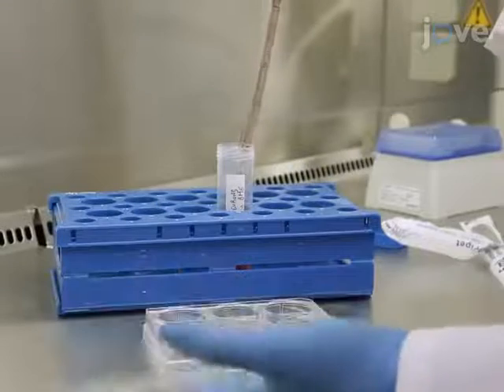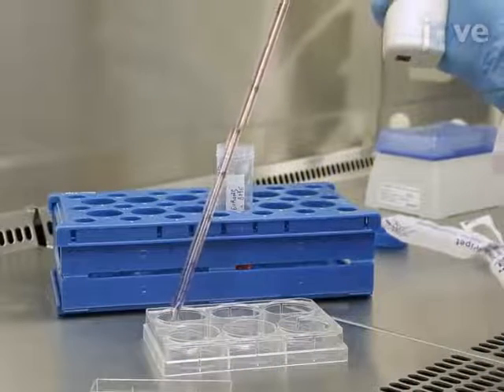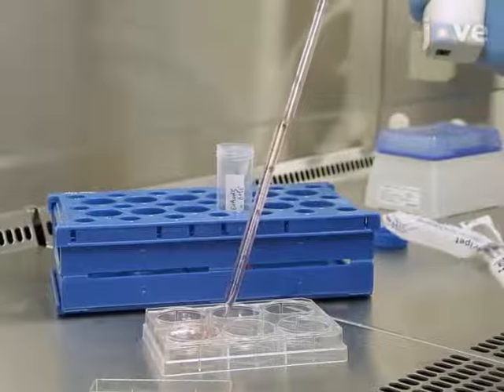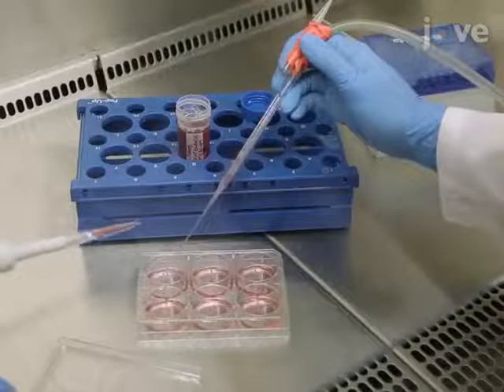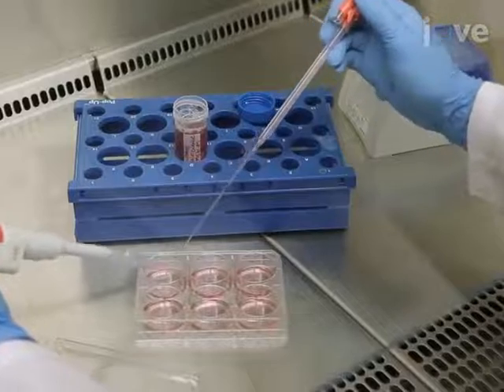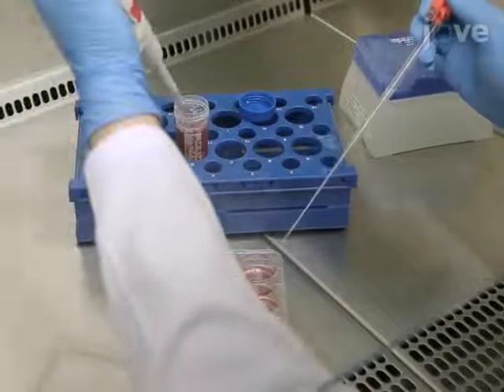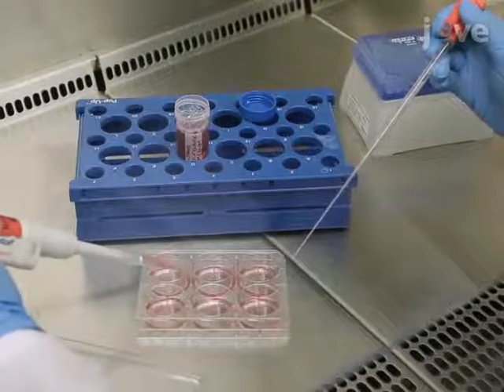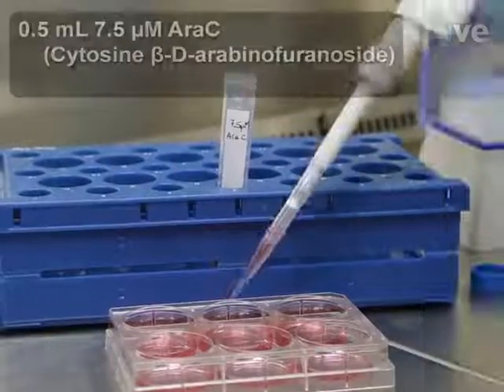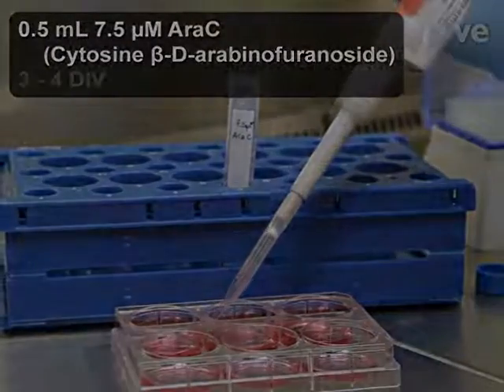First, use 6 well plates, plate 500,000 neurons per well, and use 2.5 milliliters of attachment medium per well. After incubating the plate for 4 hours, switch to 3.3 milliliters of maintenance medium per well, and if astrocyte overgrowth is observed, add 0.5 milliliters of maintenance medium, supplemented with 7.5 micromolar of Ara-C at 3 to 4 DIVs.